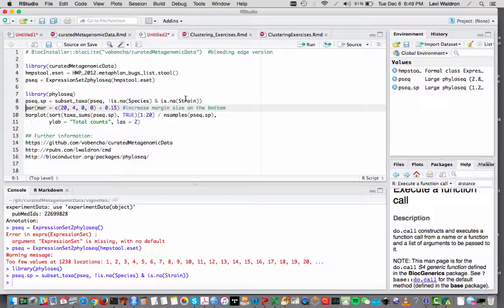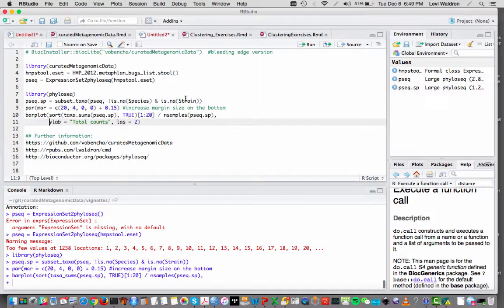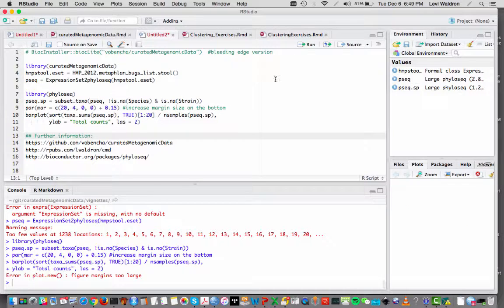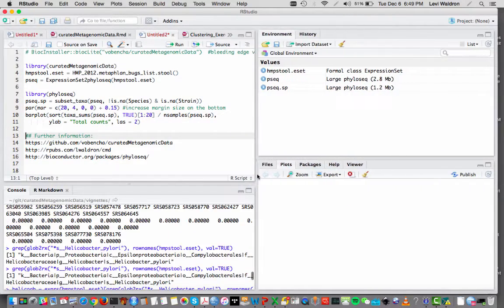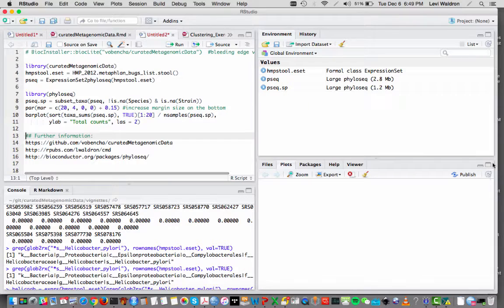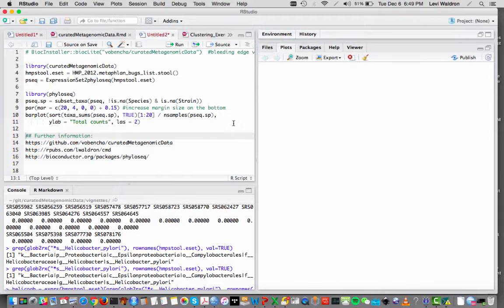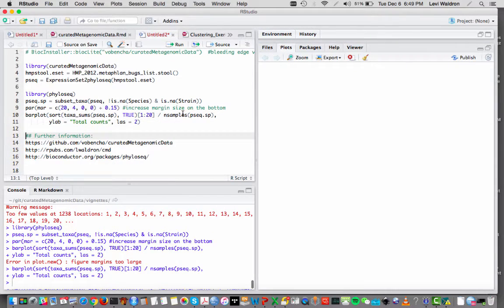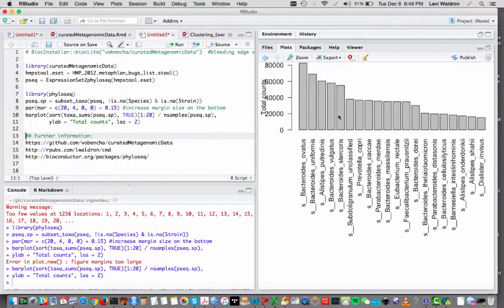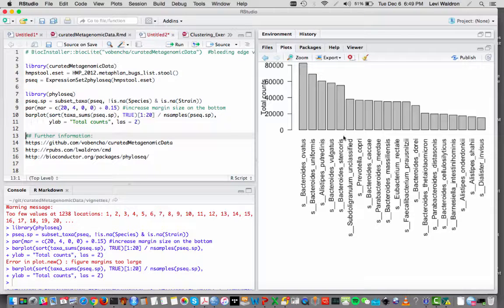But this is going to allow me to do some things like subsetting taxa to keep only species and strain level data and making a bar plot of these. Need a little bit more room here.